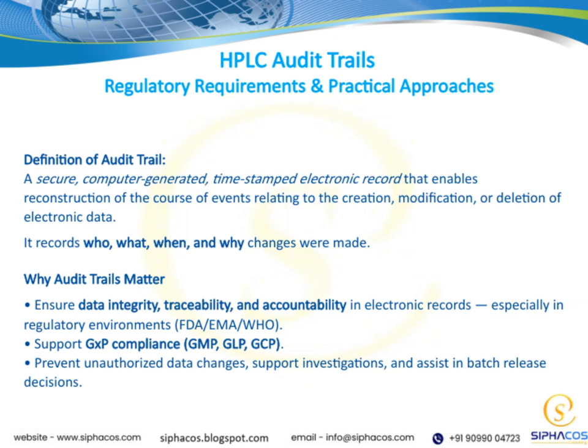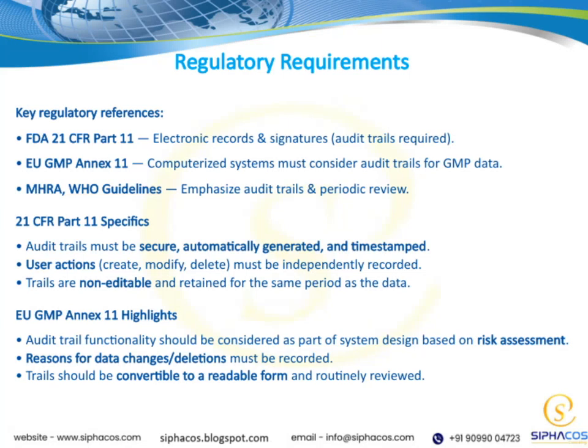When it comes to HPLC systems, regulatory requirements for audit trails are particularly important. We need practical approaches to implement and manage these audit trails effectively, ensuring they meet both the legal standards and our operational needs. So, in summary, a robust audit trail is fundamental for regulatory compliance, data integrity, and operational confidence in our laboratory processes.